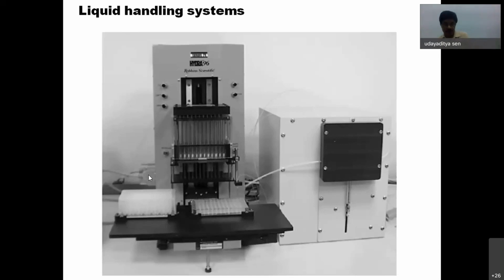Okay, so this is roughly about crystallization, but there are some other parameters also that can affect the crystallization, like magnetic field or electric field, and this is recent development, and maybe microgravity also can change your crystallization condition. Recent development is electric field or magnetic field, and I can tell you one story that while I was in postdoc, one of my friends was crystallizing the protein, but the cover slip he used to crystallize on, he used to keep it in aluminum foil.